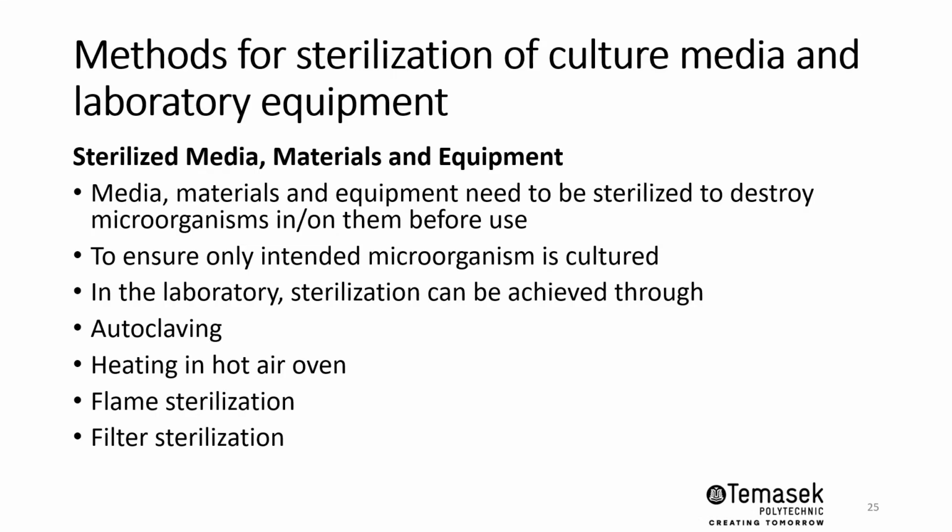I want to switch gear now and talk about the methods for sterilization of culture media and laboratory equipment. So why the need to sterilize media and the equipment associated with it? We want to do this because the aim is to destroy any microbes that are present on them before we use it, so that we can ensure that only the intended microorganism is cultured in the process. We won't inadvertently introduce other undesirable contamination or other microbes into our microbe of interest.